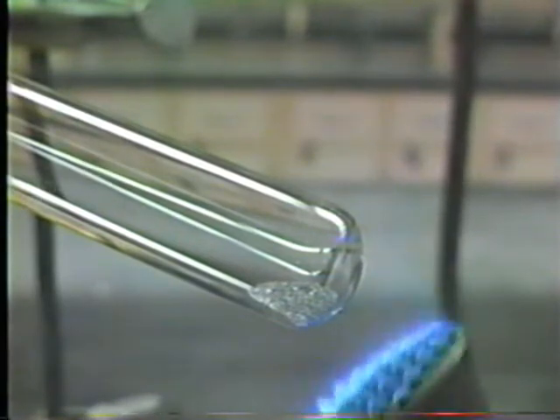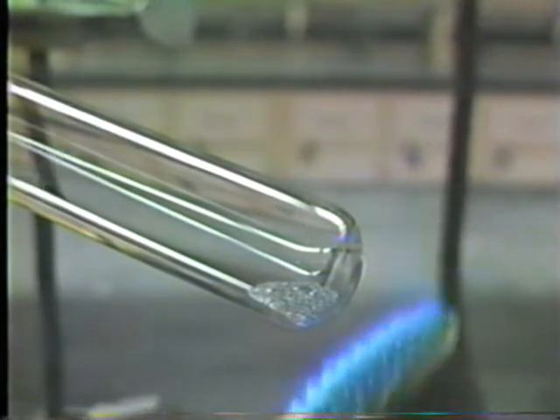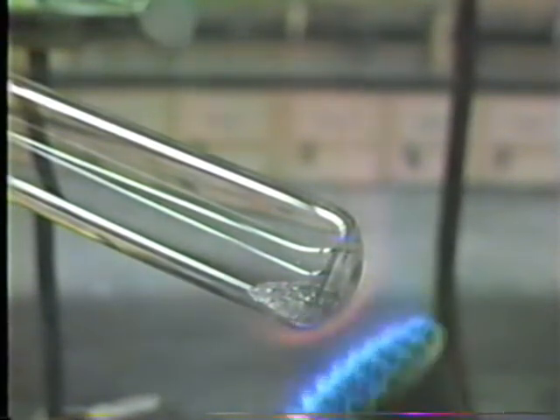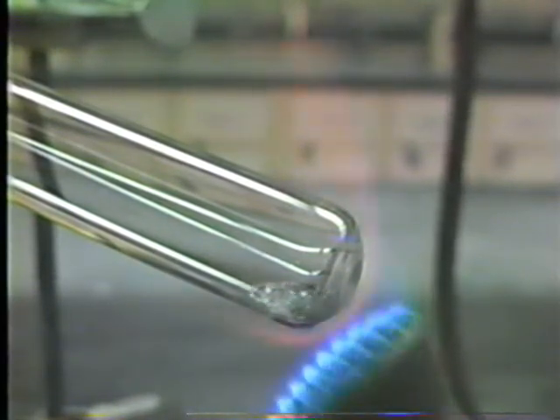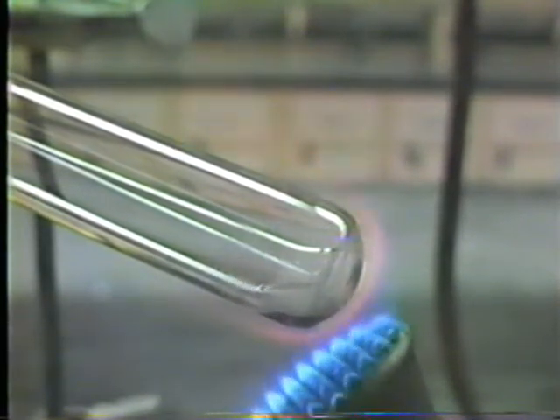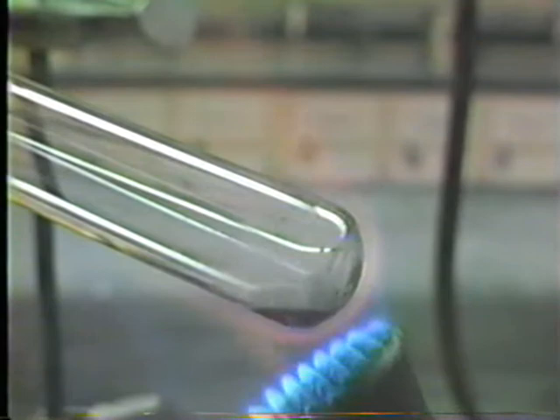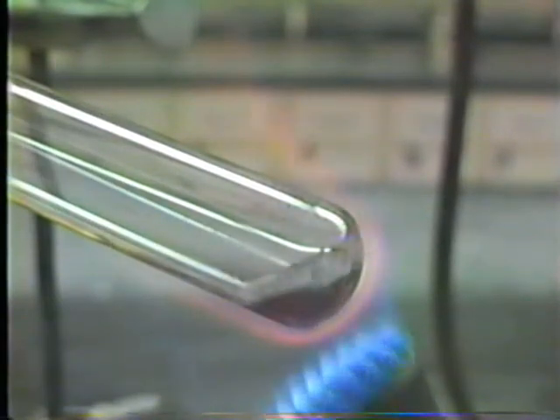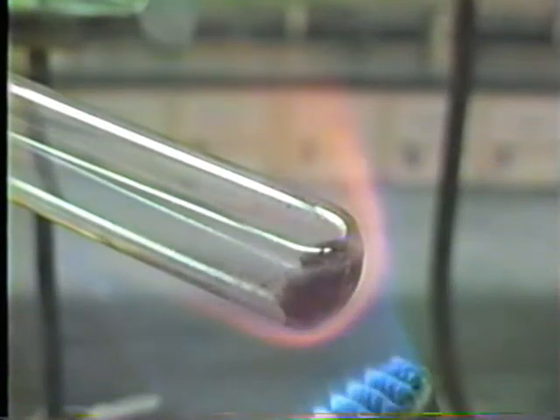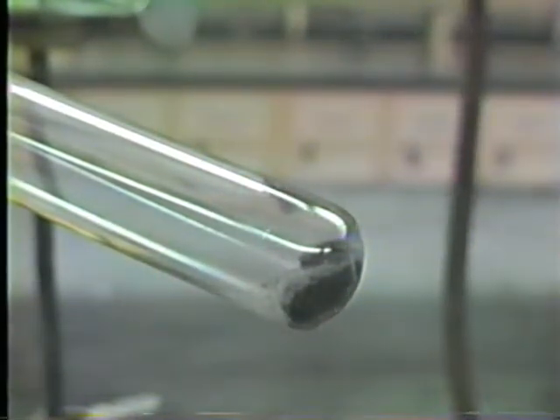And as we pointed out before, the first thing that happens is the tube gets hot and there will be some gas due to expansion. Then you get melting, and the melting material will generate the oxygen. And finally, it will re-solidify, and that's the end of the reaction.